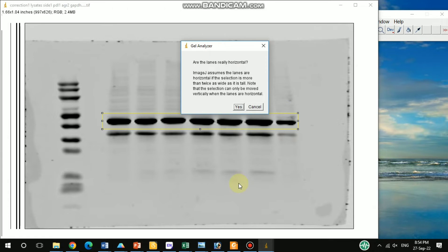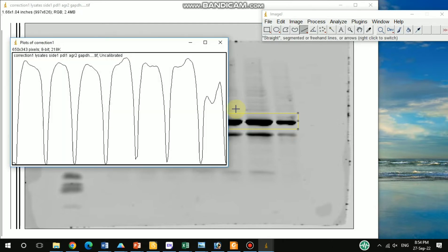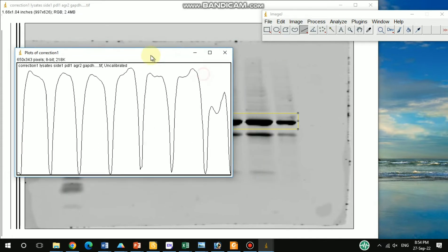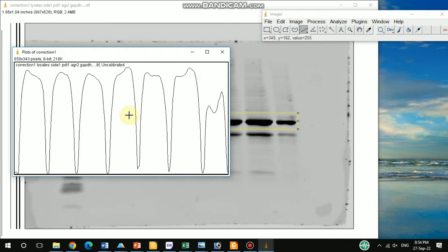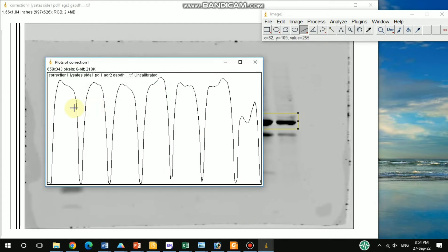After pressing Ctrl+1, you will see a pop-up window — click Yes. Then press Ctrl+3. When you press Ctrl+3, another window will pop up showing the peaks of the corresponding bands. Here you can see how many peaks and bands there are: one, two, three, four, five, six, seven.